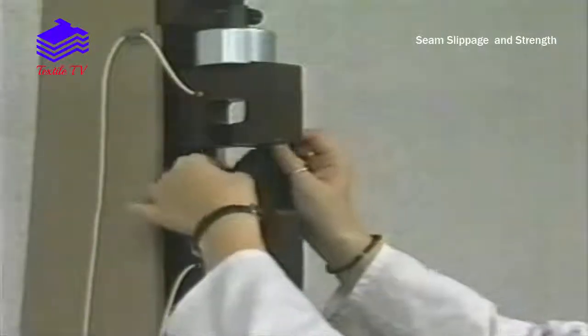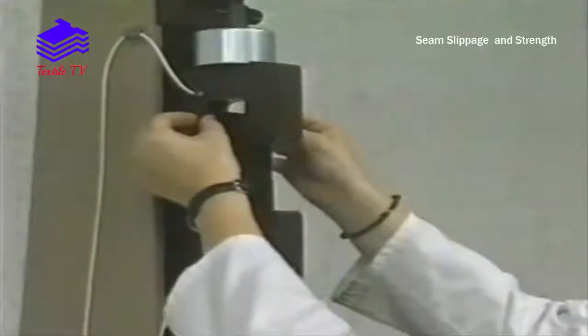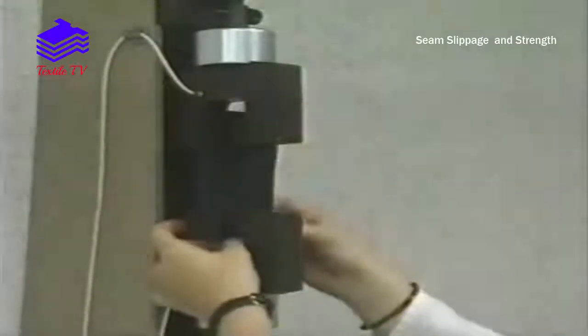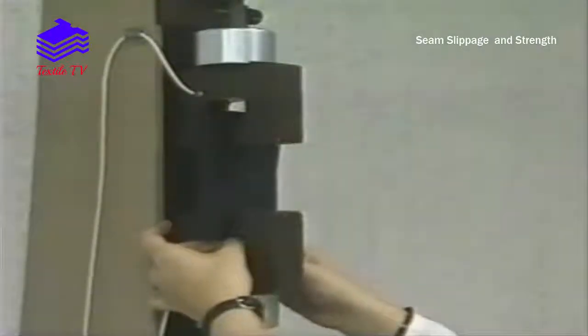An unseamed test specimen is mounted into the top jaw and clamped in position, and then mounted in the bottom jaw and clamped in position, ensuring that the specimen is straight.